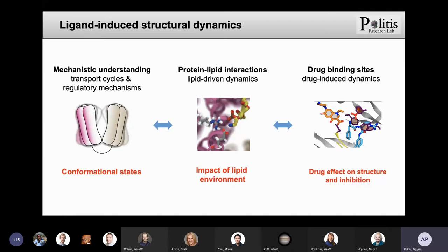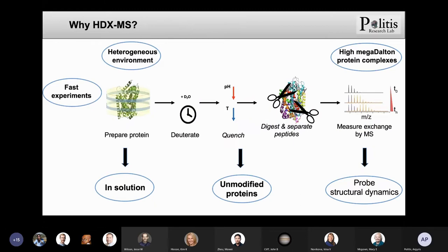So for the questions that I've just described to you, we're using a technique that is called hydrogen deuterium exchange mass spectrometry. Some of you might be familiar with mass spectrometry, so I will try to briefly explain how that works.